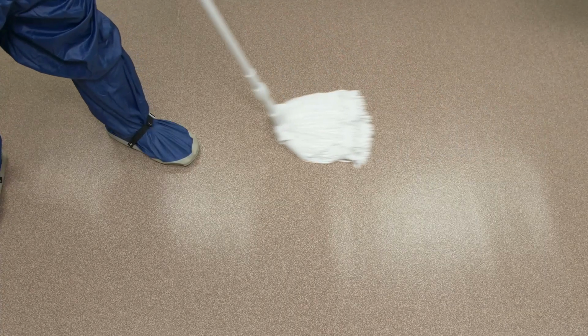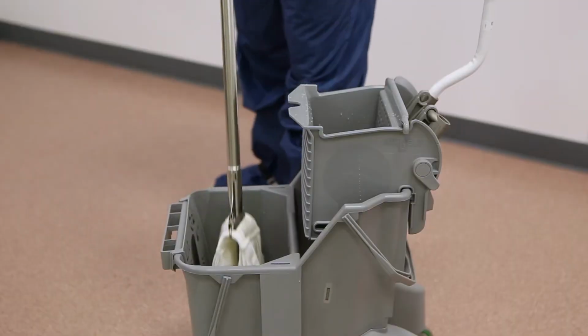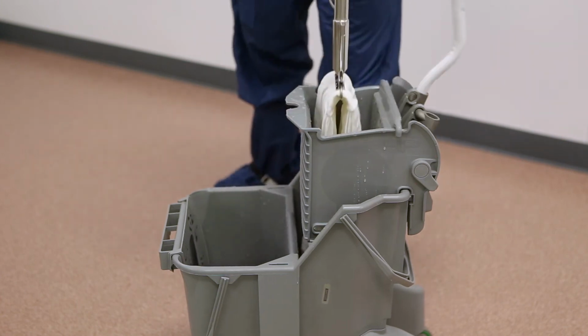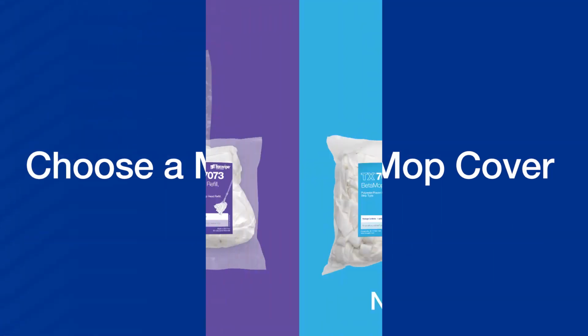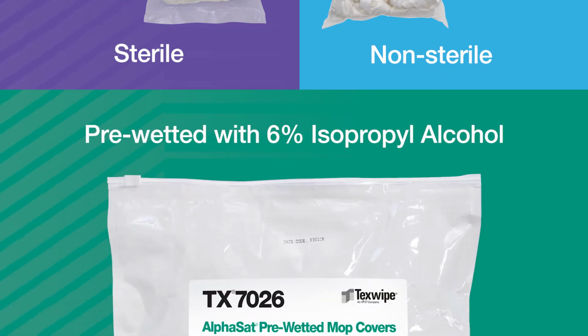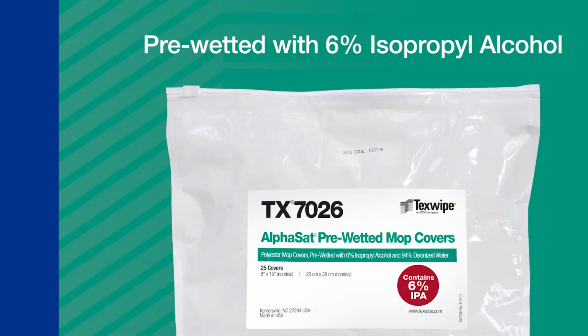String mops are made of tubular or flat strips of material and generally hold more solution, so a larger area can be covered between re-wettings. Depending on the requirements of your room or process, choose sterile or non-sterile mop covers for flat or string mops. Also, for cleaning walls, use mop covers pre-wetted with 6% isopropyl alcohol.